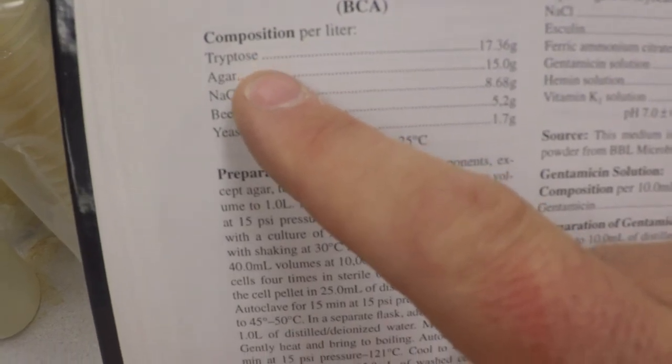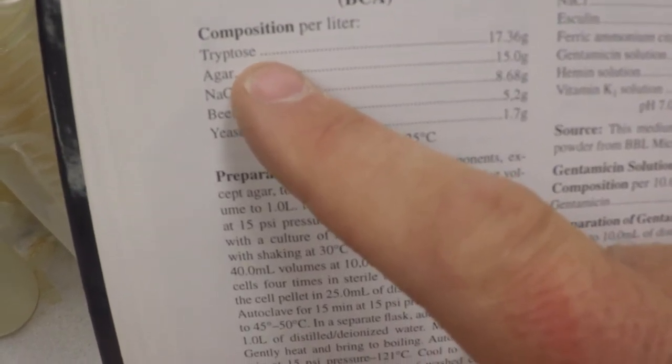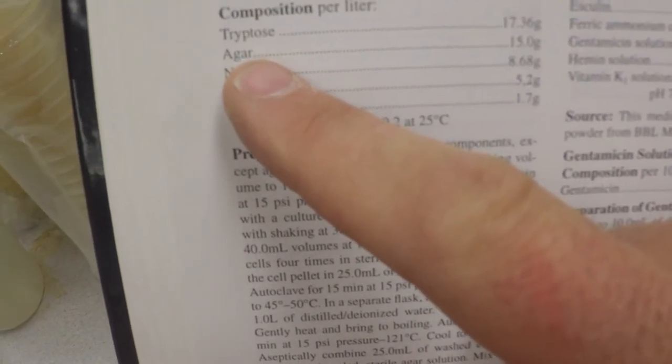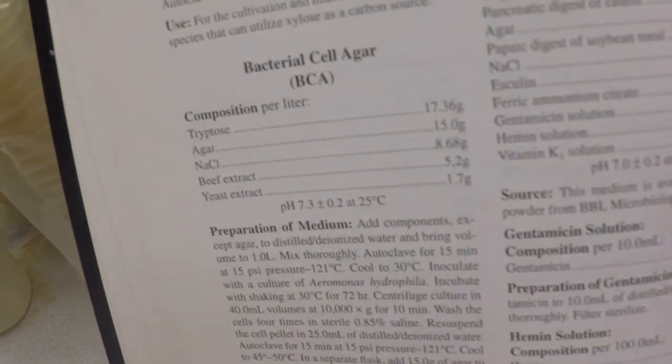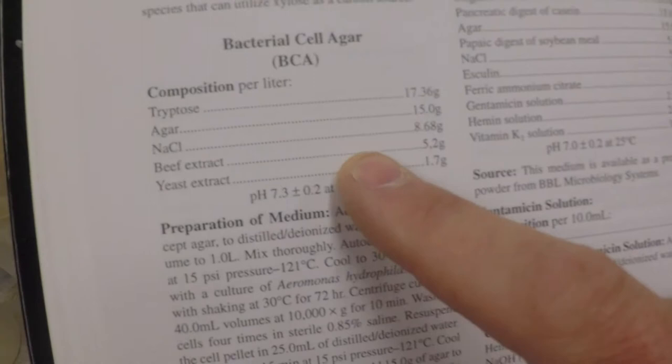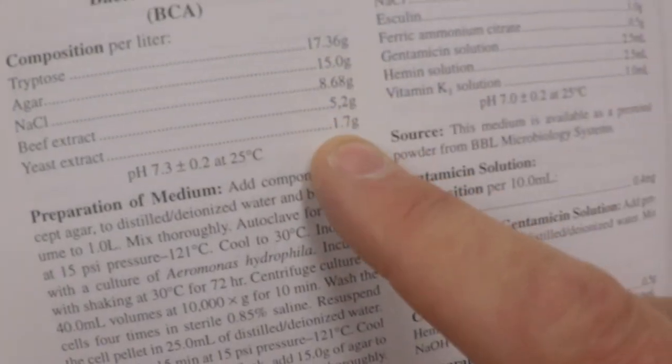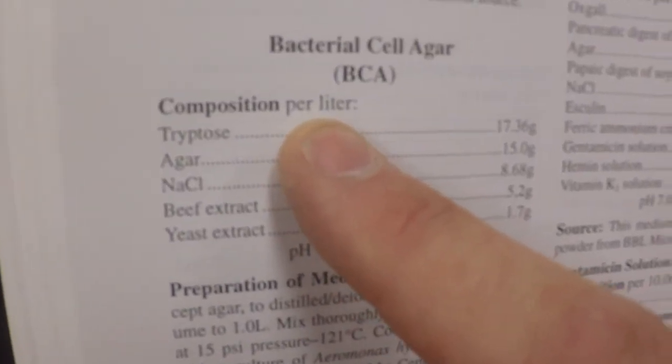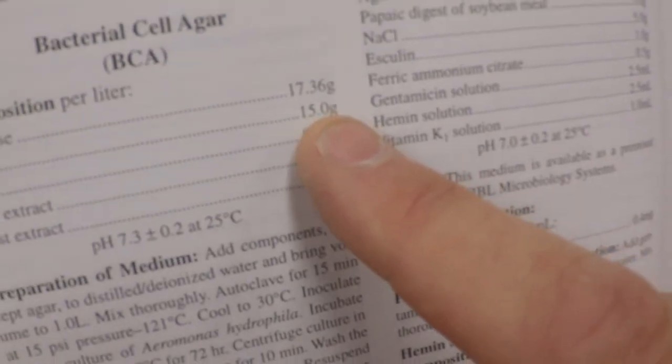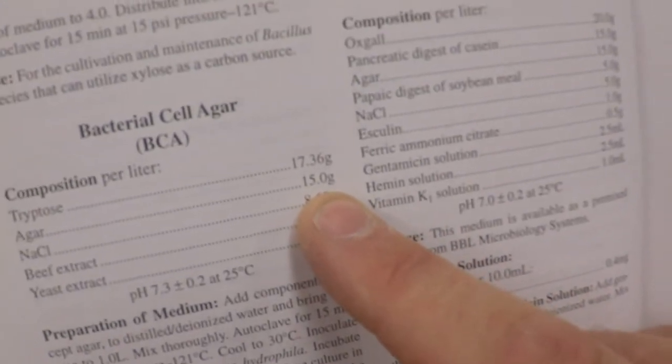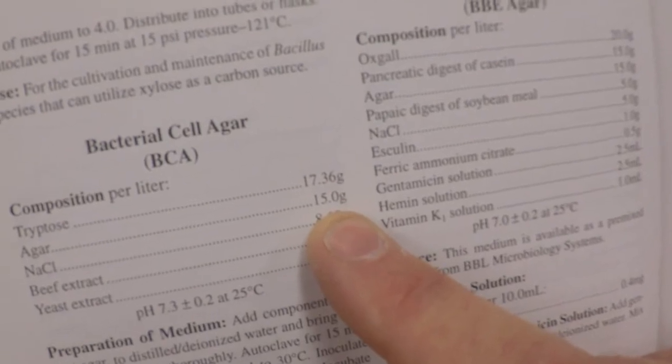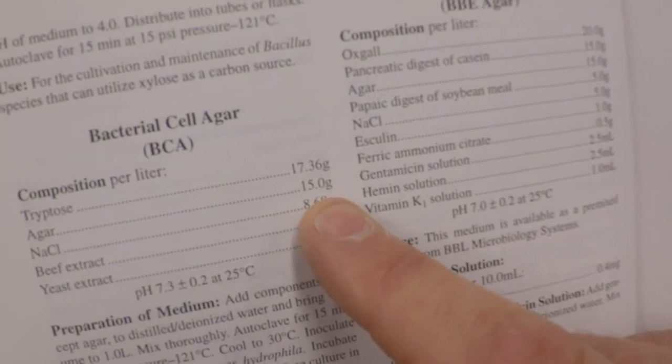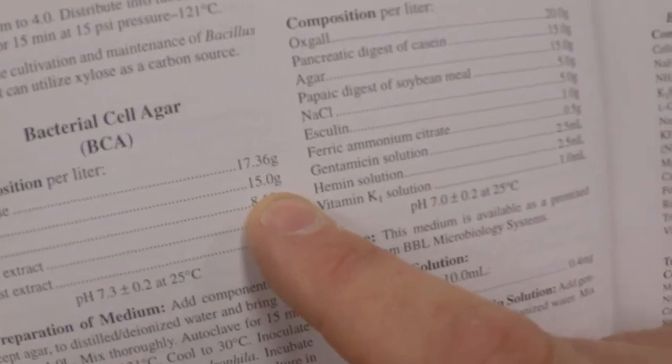Tryptose—same thing, that's a tryptic soy digest of beans. Tryptic agar is what you're going to use to solidify the plates if you're going to pour plates. If you're not pouring plates, you don't put agar in there. It gives you all the concentrations that you need. This is per liter. Typically, agar, 15 grams in a liter—that's 1.5% final weight per volume—is going to give you a nice petri dish plate.